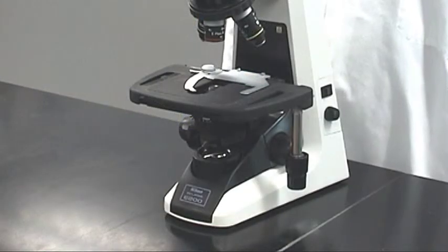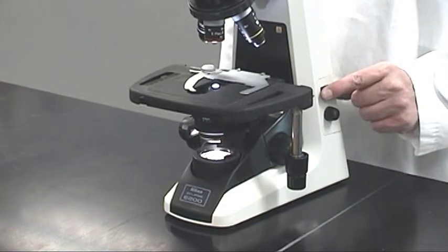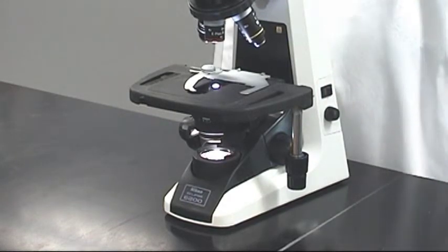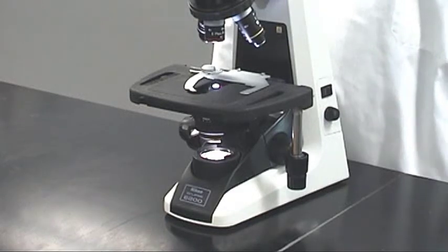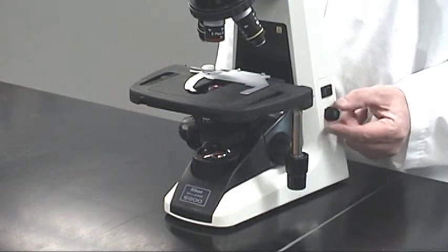The light switch, located on the left, turns on the lamp. The rheostat, or voltage control knob, is just below the light switch. Rotating it changes the intensity or brightness of the lamp.